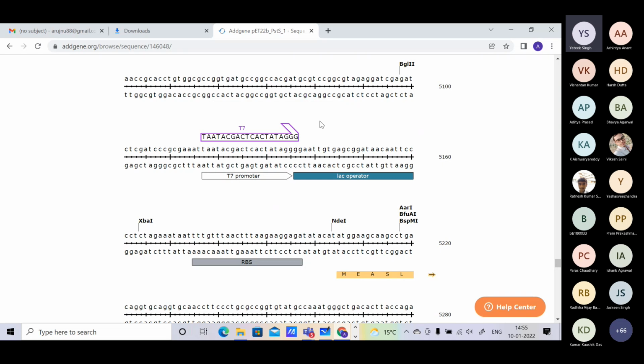These are all constructed using software called SnapGene. In SnapGene, you can use different functions. Say somebody tells you that you have to clone this part with the T7 vector. So we have to amplify the gene. How do you amplify the gene? We use a primer to amplify the gene. And how do we construct a primer? We can highlight the primer over here using the SnapGene software.